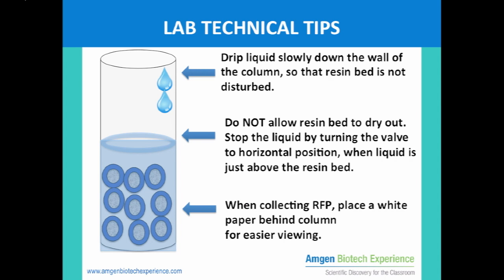Here are some tips for this lab. Drip the liquid slowly down the wall of the column so that the resin bed is not disturbed. Do not allow the resin bed to dry out. Stop the liquid by turning the valve to a horizontal position when the liquid is just above the resin bed. When collecting RFP, place white paper behind the column for easier viewing.